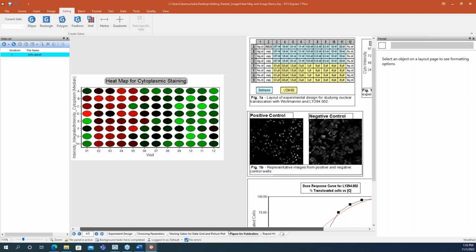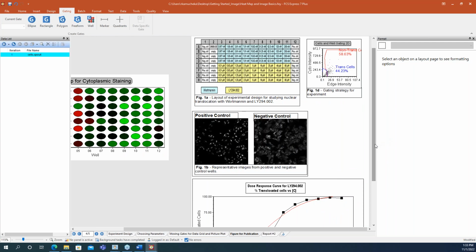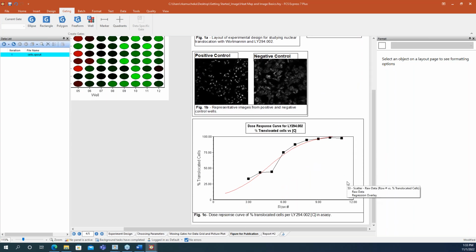So here on this last page, this is another feature. With our spreadsheets, we can introduce great things like these curves. We can show some additional information in different ways. We can use charting tools, and we can use additional information to really bring home whatever the end goal is from our analysis. So on a lot of posters, we want to see what's different between our control and our test. These are elements that are already in FCS Express.